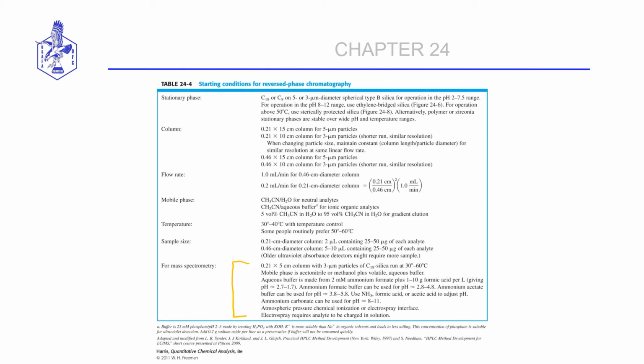Okay, the most sophisticated detector to interface to a chromatograph, a liquid chromatograph, is a mass spectrometer. And the operation of that mode of detection would then require a very detailed series of choices therein. So this slide is simply meant to remind you of the complex nature of carrying out an effective separation by LC. It's not impossible, but it certainly is not simple either.